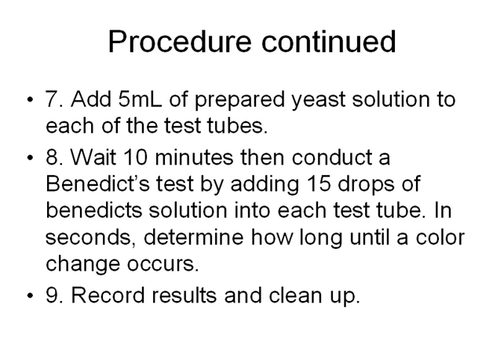Lastly, add 5 milliliters of prepared yeast solution to each of the test tubes. So you'll have a grand total of 15 milliliters of prepared yeast solution, 5 per test tube. Again, rinse out your graduated cylinder when you're done.